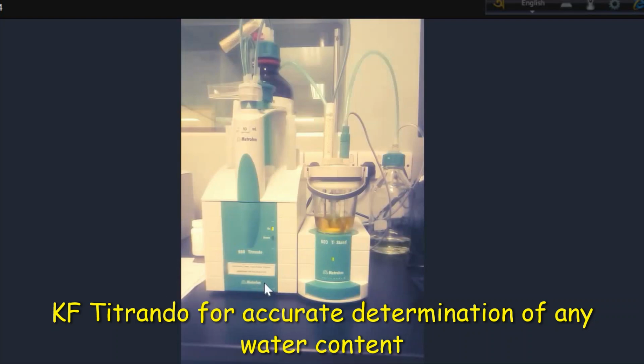Today I will discuss the Karl Fischer titrator. The Karl Fischer method is widely used for measuring trace amounts of water contained in various substances, particularly in the pharmaceutical industry and the petrochemicals, and it is named after the chemist Karl Fischer, who developed the technique in the 1930s.